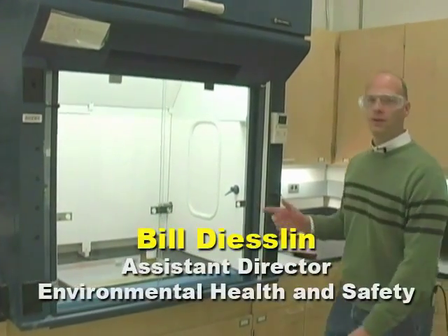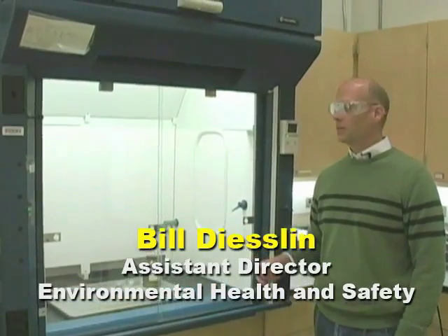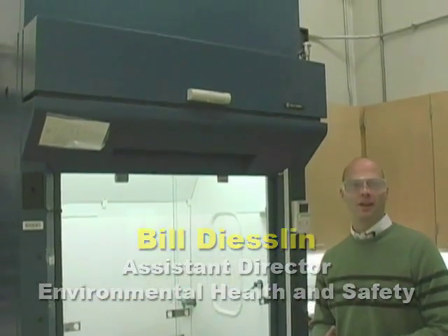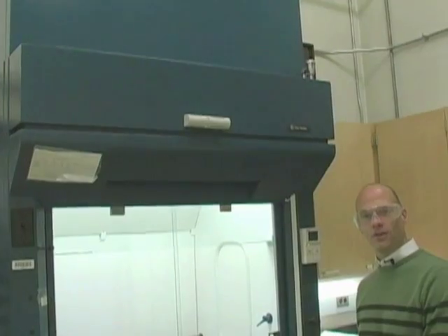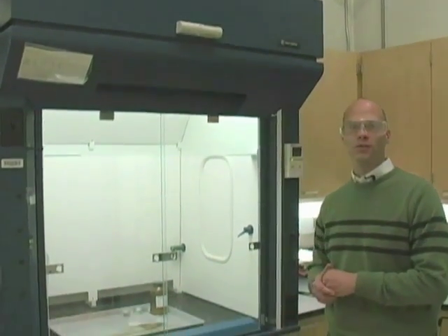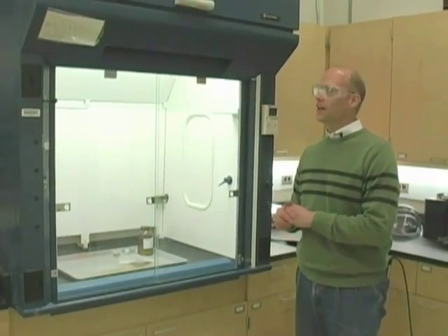Well, if you work in a laboratory, you know what this is. It's a fume hood, but it's also an opportunity to save a lot of energy. It turns out that just one fume hood can use as much as six thousand dollars a year in energy. That's not just the energy to run the fan, it's the conditioned air in the building that's going into the fume hood.